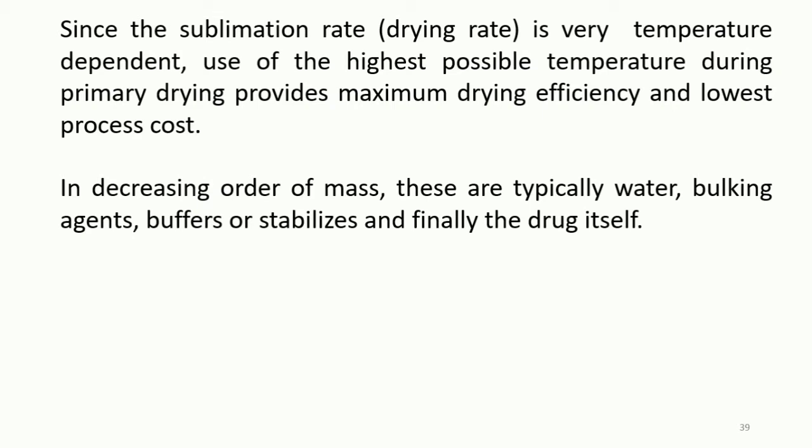Since the sublimation rate is very temperature dependent, use of the highest possible temperature during primary drying actually provides maximum drying efficiency and low process cost.